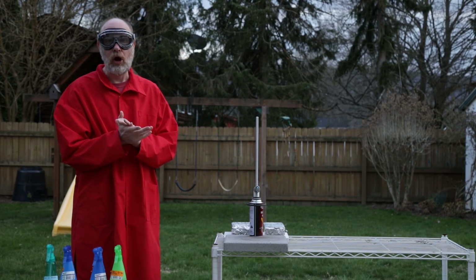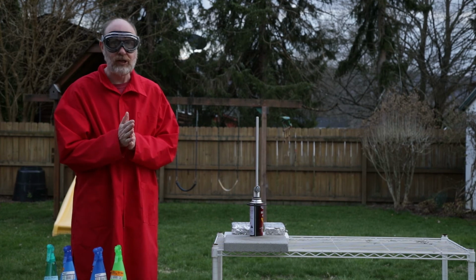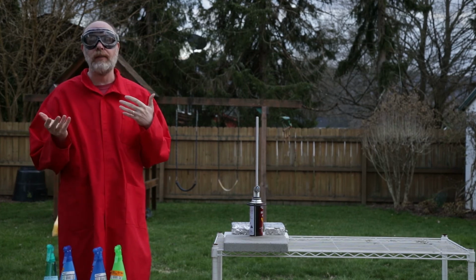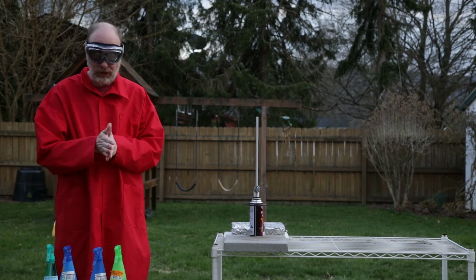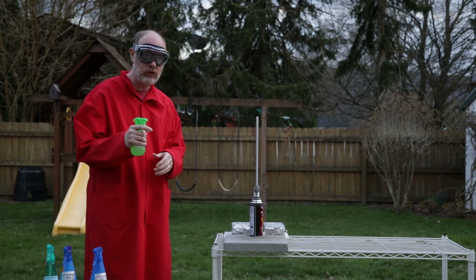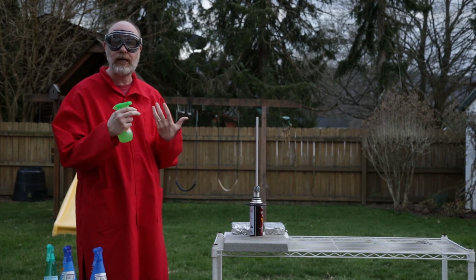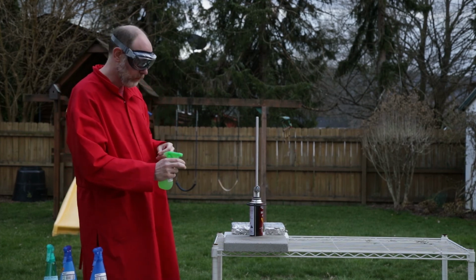All right. Also, this is something you can't do on your own. You know, these solvents are very flammable, and we have to be very, very careful about doing an experiment like this. So what we're going to do is we're going to work from the more energetic side of the spectrum down to the less energetic side, and we're going to start with green. We're going to use boric acid, and we're going to spray boric acid in methanol into this flame, and you should see a green color resulting from the excitation of the electrons in the boron. So here we go.